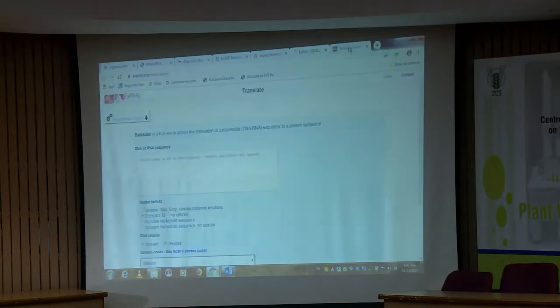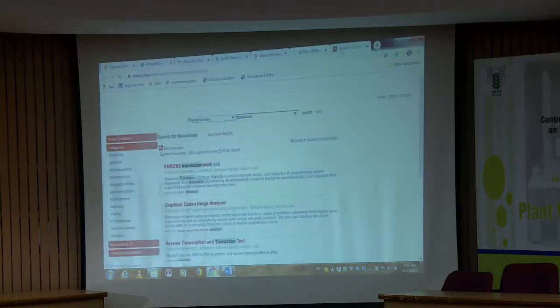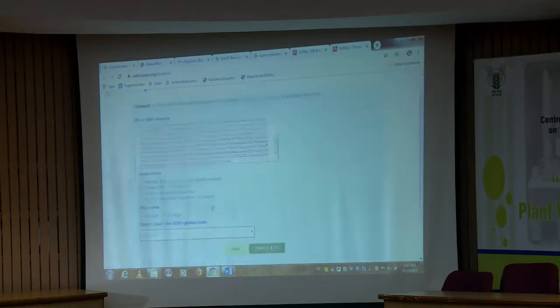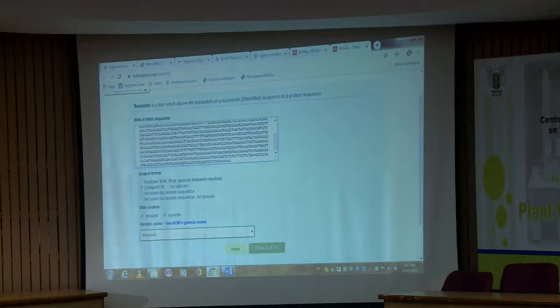I will just show you how it will give you the hit. See here different versions are there, the compact methionine to M and stop codon, it will highlight as dash, which you have to delete from your sequence before preparing the file for GenBank submission, because wherever the stop codon will be there will be a dash.